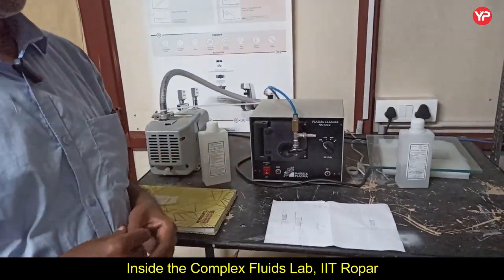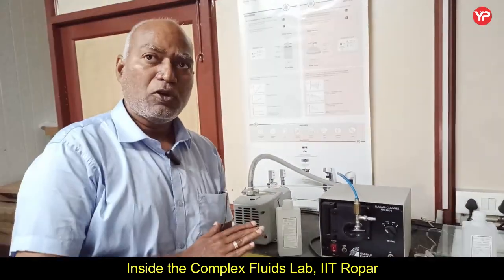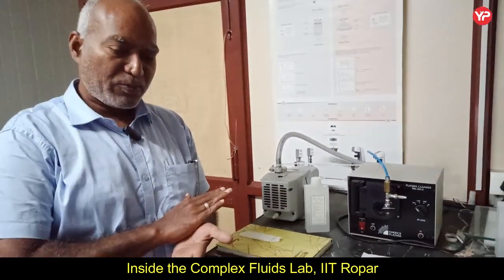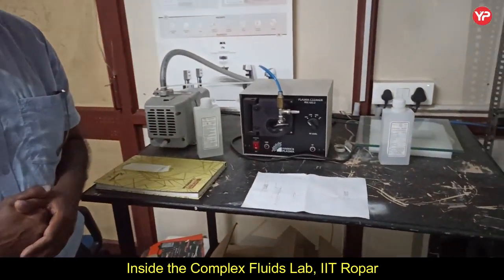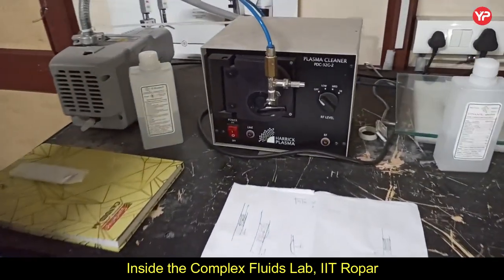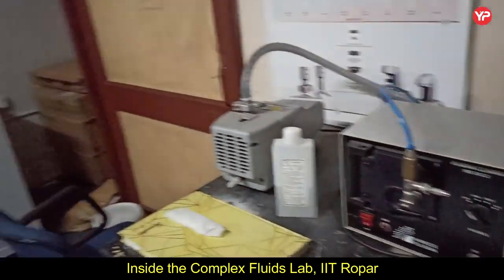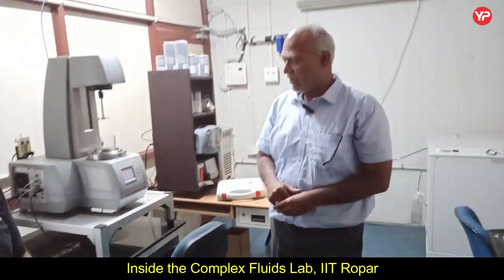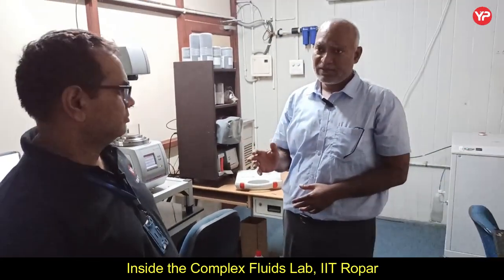Then here we have a plasma cleaner. We use this to clean surfaces if we want to coat surfaces with PDMS or any protein, so we need to clean them. This is the oxygen plasma cleaner we have in our laboratory. So that is all for this lab. So this is what we have in this lab, and all these equipments are used to study rheology and the dynamics of complex fluids.